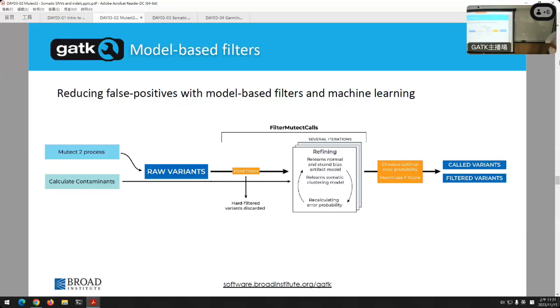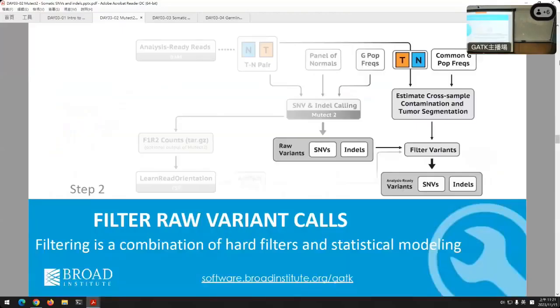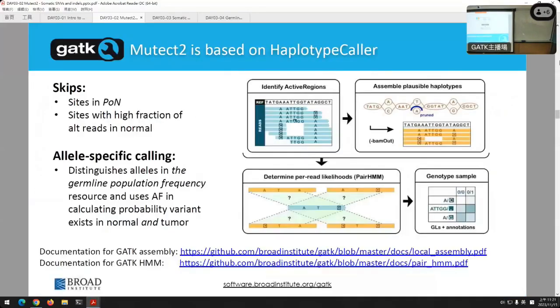So can we use RNA-seq data for actually figuring out the allelic imbalance? Okay, that's interesting. I haven't actually used it that way, but Eric's answer is that it should work with RNA. Huh, that's a cool use case. Sure thing. Which one was that, Eric? Here, was it this one? All right.